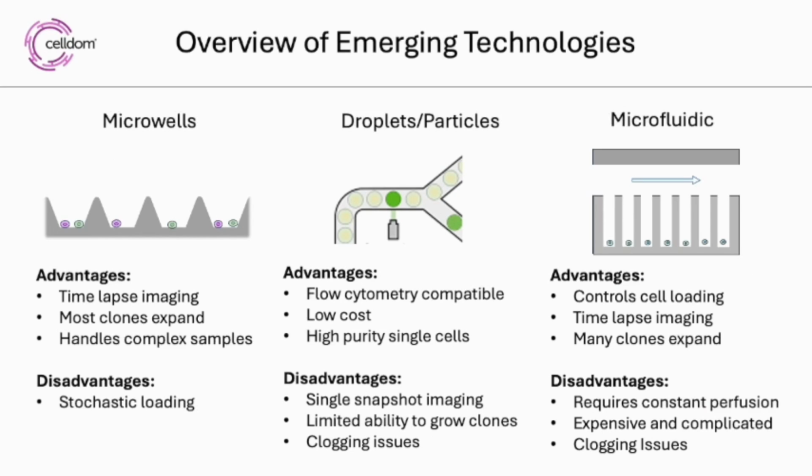Of these 3 classes, microwell technologies are the simplest and the most flexible. They have the advantage of being able to perform many continuous measurements of the same single cells over time, which is needed to determine growth rates or other functional properties, like its ability to secrete antibodies or growth factors at a high rate, or its status of differentiation in the case of iPSCs, or its ability to develop novel reporter cell lines from various types of monoclonal sources.